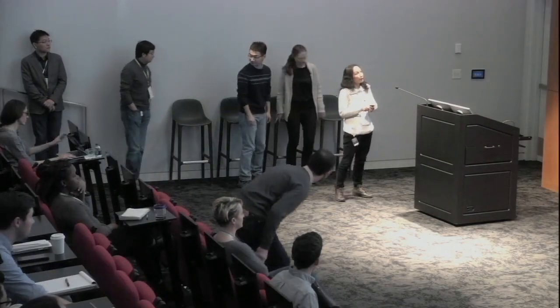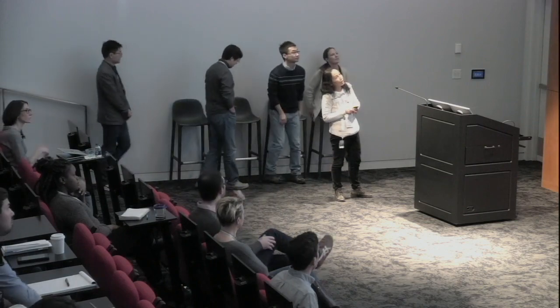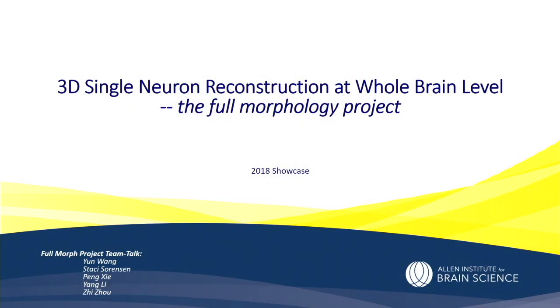So here we are reporting the 3D single neuron reconstruction at the whole brain level. This is a full morphology project that we have been performing for nearly 3 years.